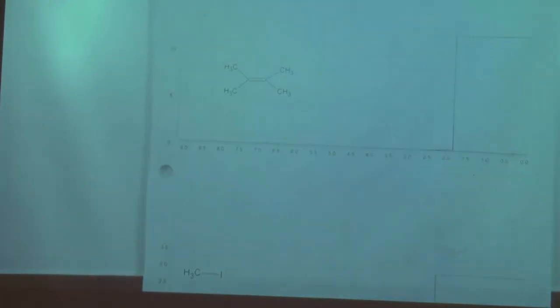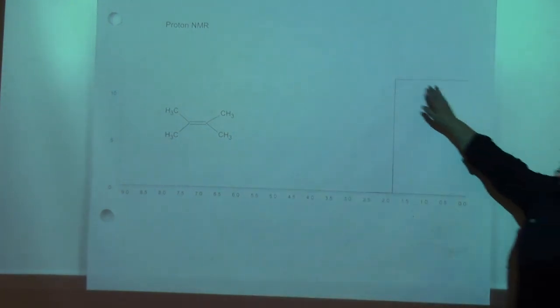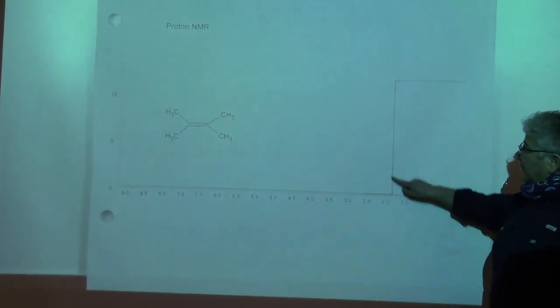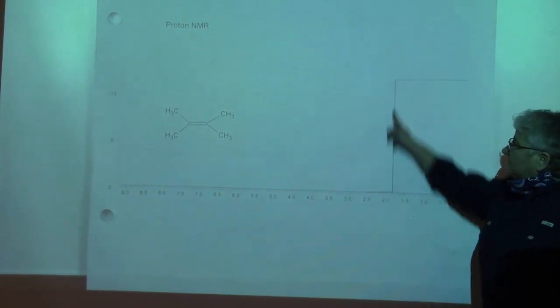I think I gave you a whole variety of examples. So here's the first example that we did. For now you can ignore, this is actually a thin line that is doing that. You can ignore that piece and that piece, but you can just see there's one peak.